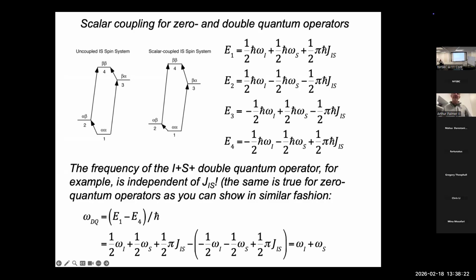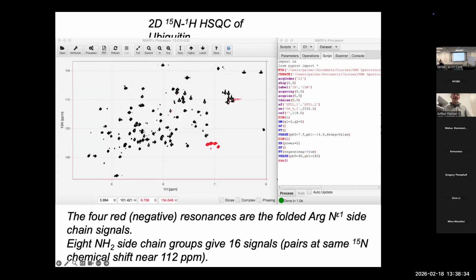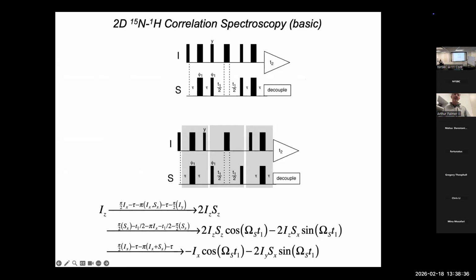Now, after we talk some on relaxation, we're going to come back and look at a lot of pulse sequences. But you should work through this one some more on your own, because this will help you get started on the problem of building an HNCO, because essentially one's going to replicate these kind of blocks.